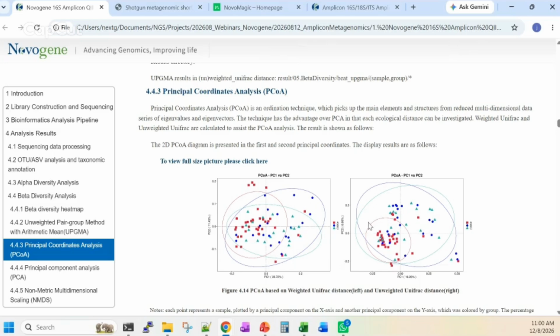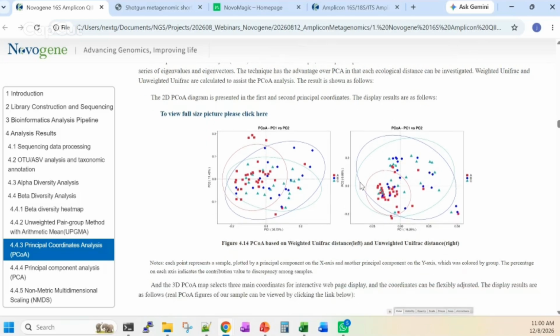It's just that I think sample group A is quite close within each other, and then B and C are quite overlapping with one another, and the distance within the samples is also larger compared to group A. So from this particular PCoA plot, I would say all the samples are sharing similar microbial groups inside the samples. It's just that their abundance values could differ slightly. But overall, I don't really see very much difference between group A, group B, and group C.